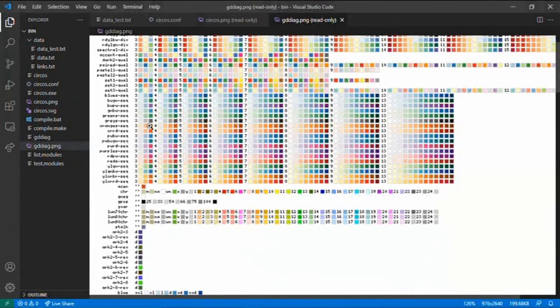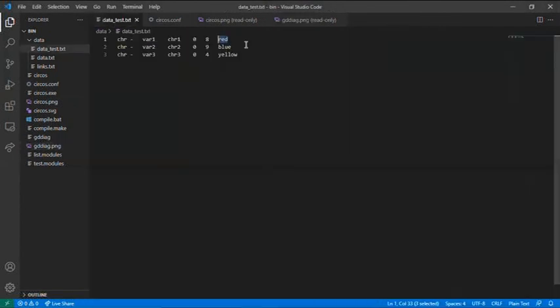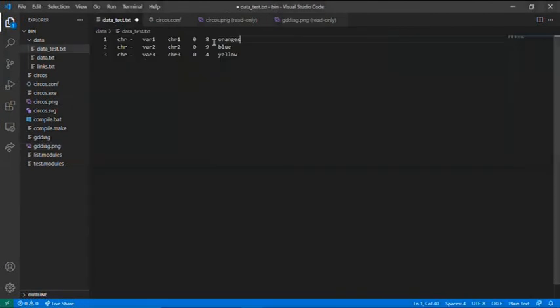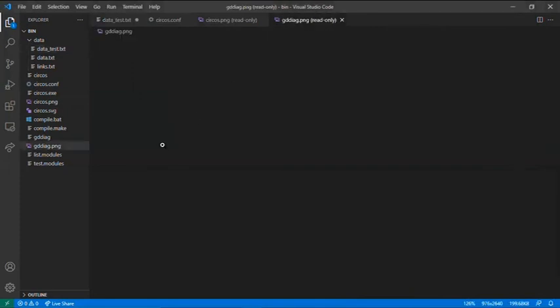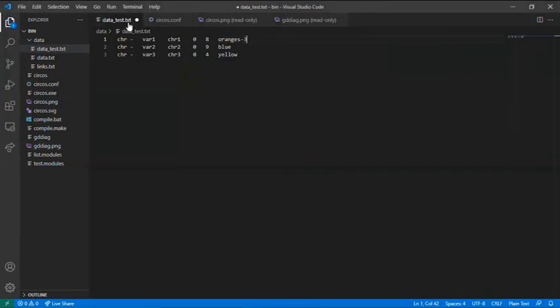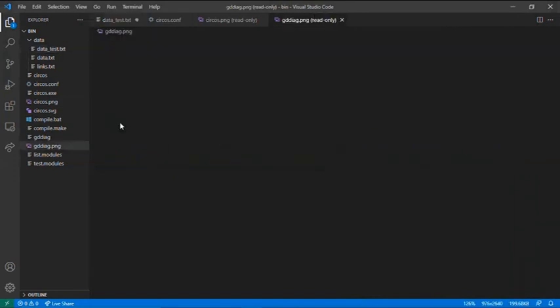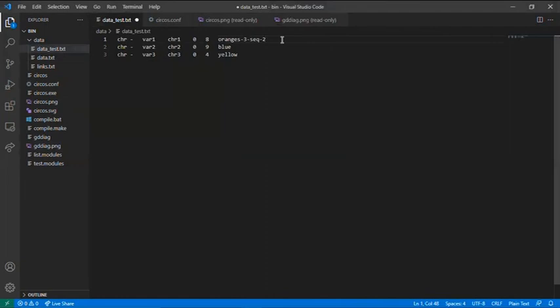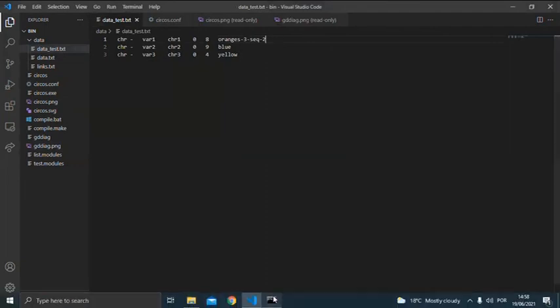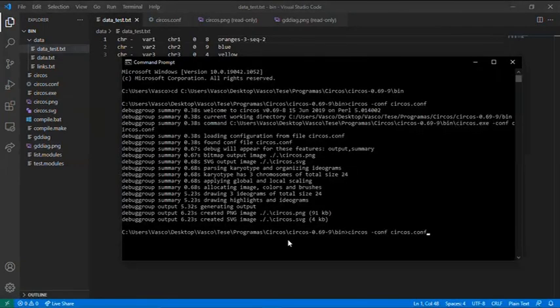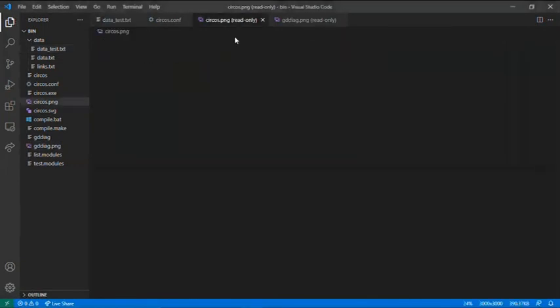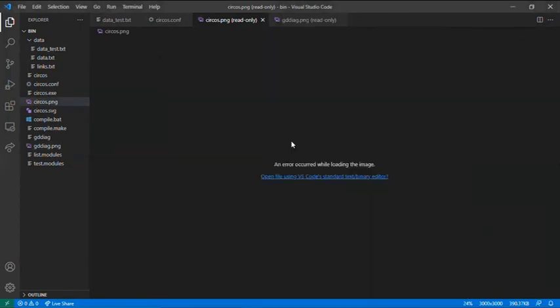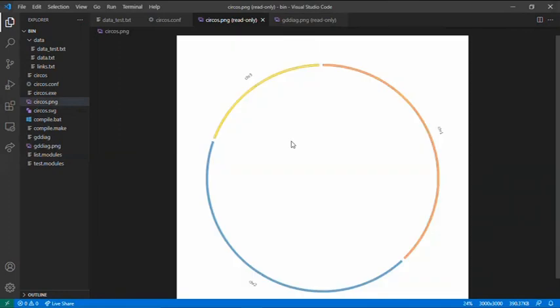How do I choose this color? You come here. Oranges. Three, the number of the gradient. Seq, and the number of the position. I will write two. Save the file. Run again. And this is the final image you get.